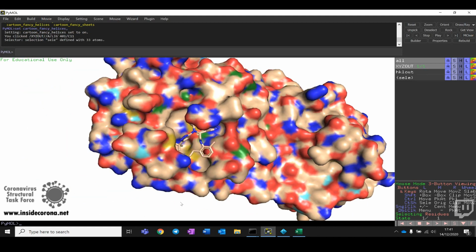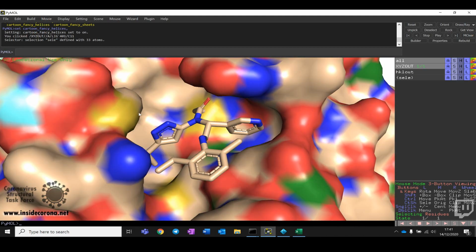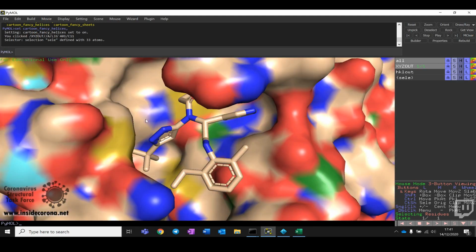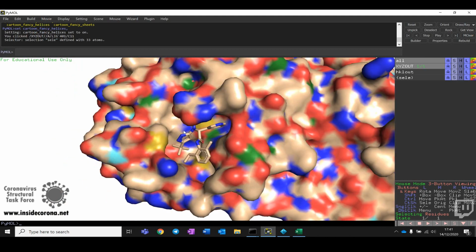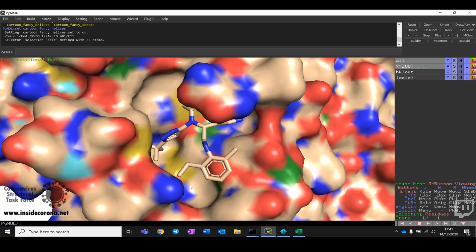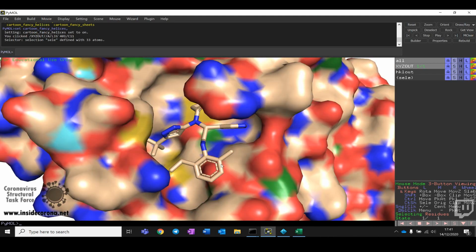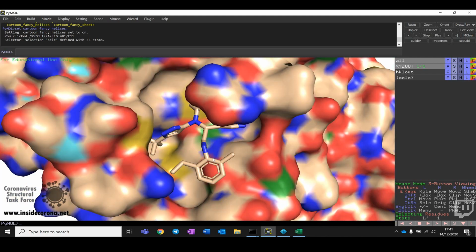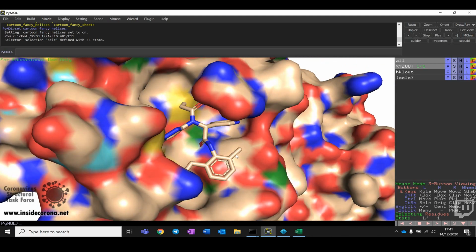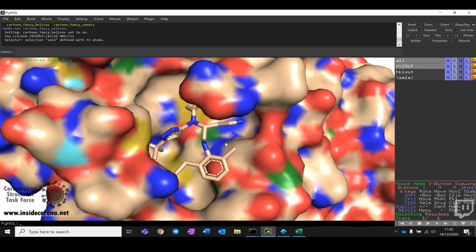Center on our precursor drug. You can see how it fits nicely into this pocket. So if we were trying to further design this drug, you can see we've got this pocket down here where we could definitely build something in, and that will hopefully improve the binding of our drug. And we'll end up with a more specific and more powerful treatment.